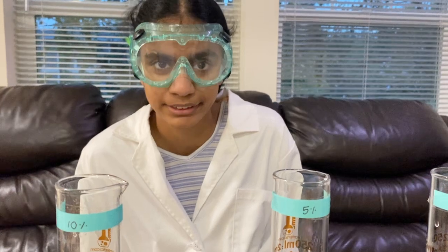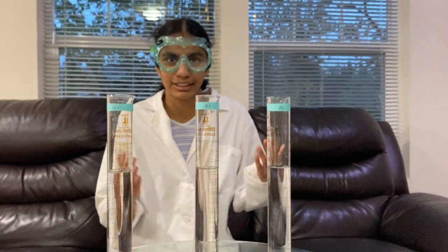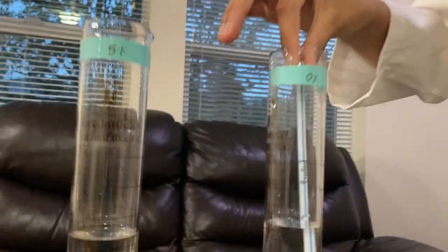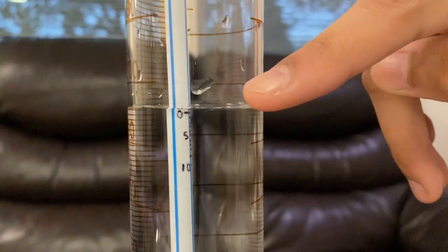Again, these 100 milliliters account for the volume of those 10 grams. Now I'll be placing our salinometer in these solutions. This is my 0% salt solution and I'm going to place my salinometer. As you can see, the water level is hitting right where the 0% marking is, because it's a 0% salt solution.